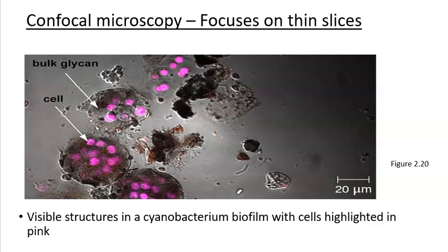And this is going to allow you to actually be able to visualize these really nice two-dimensional images, but at different depths. And so if you think about that, imagine taking slices through something, and then you take all those slices and you stack them up. Well, that's what we're doing. The other microscopes were visualizing just a slice through the whole piece, and here we're stacking all of those slices together to allow us to visualize the parts of what's inside of your specimen.